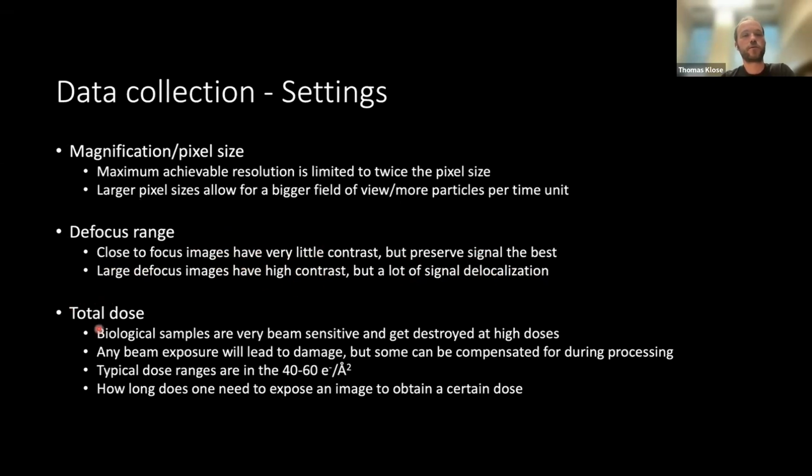And then last but not least, one has to know what dose you want to apply. All biological specimens are very beam sensitive. So when we are bombarding them with electrons, they get destroyed. You can actually see them blow up over time.